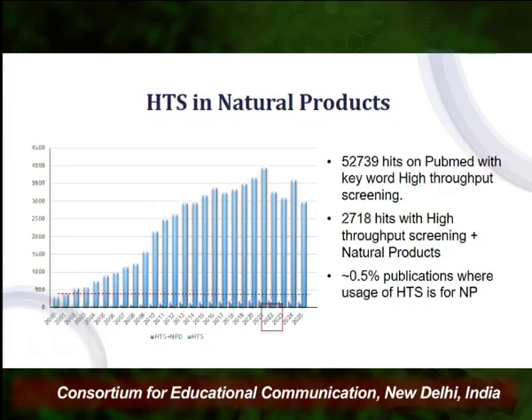Though there is an increase in the usage of HTS for natural products as well, still the figures show a very meager picture of approximately 0.5%. What are the various reasons why HTS is not so widely used for natural products? We are going to discuss ahead.